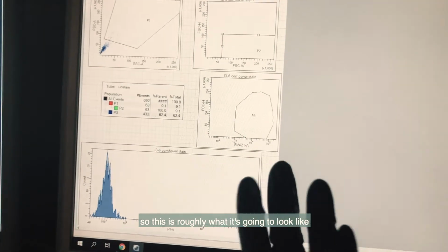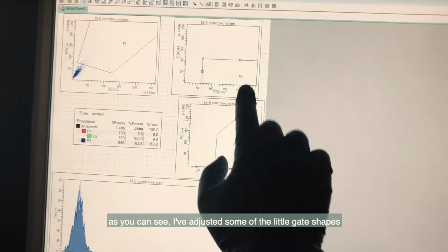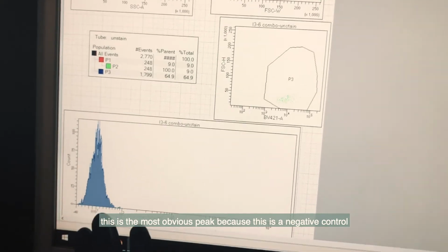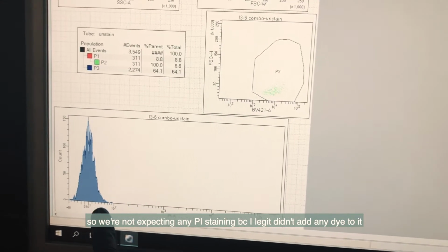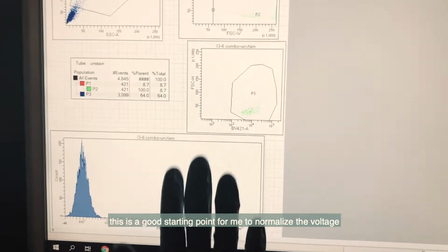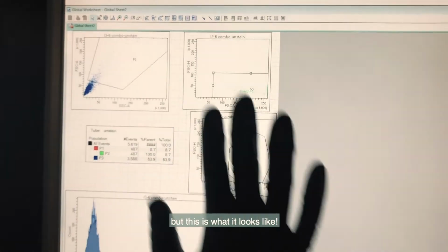So this is roughly what it's going to look like. As you can see, I've adjusted some of the little shapes. This is the most obvious peak because this is a control. So we're not expecting any PI staining because I legit did not add any dye to it. So this is a good starting point for me to normalize the voltage. And when I run the actual samples, I'll be able to show the peaks and stuff. But this is what it looks like.